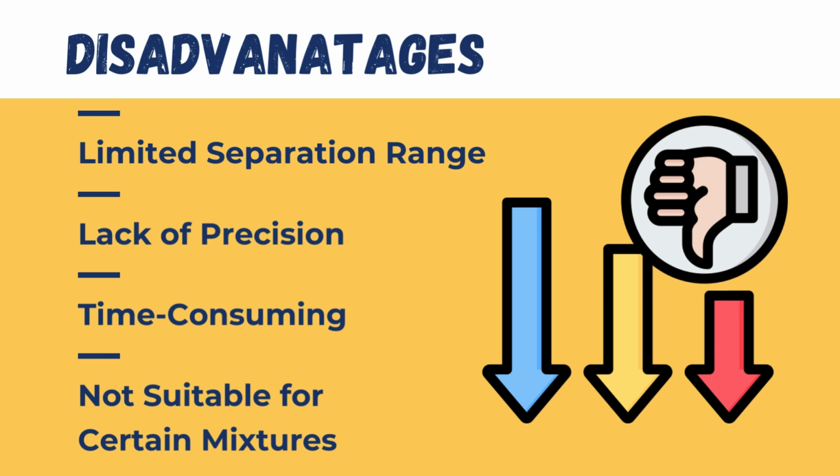The second disadvantage is lack of precision. Simple distillation might not provide highly precise separation, especially when dealing with complex materials. It may leave behind impurities or mix some components. Okay? Now the third disadvantage of simple distillation is that it is time consuming.